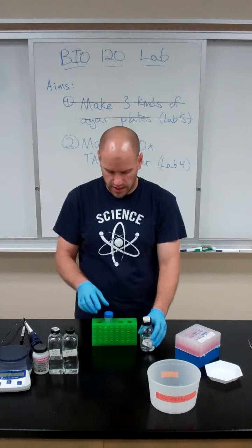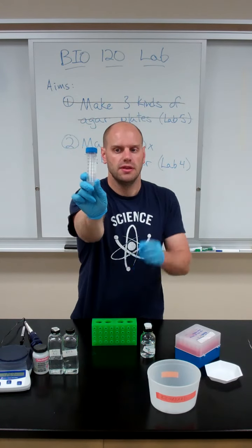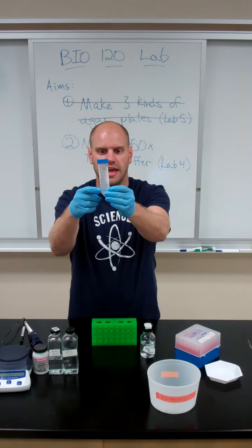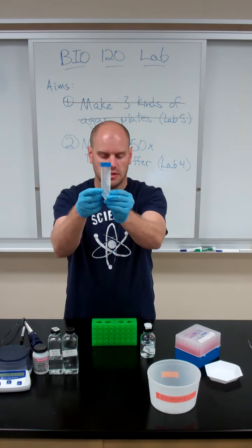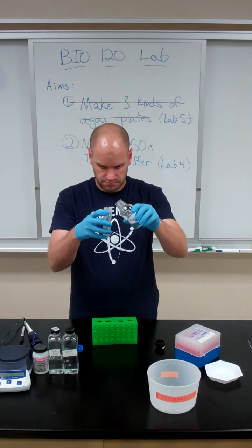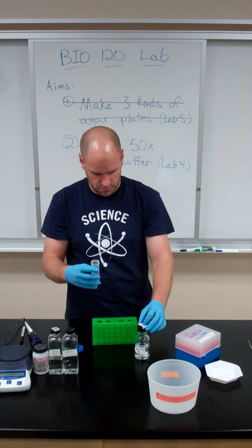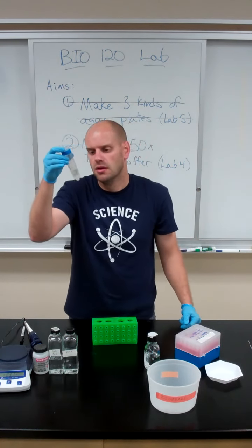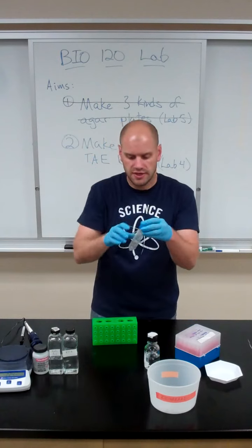Lastly, we're going to add our water up to the 10 mL mark. You'll notice on the side of your 50 mL conical tube that there are graduations — you can just add sterile water to 10 mLs, which should be about where my right finger is. We can do that by just pouring some in. Then swirl your tube a bit and wait for your Tris powder to dissolve, and you'll have 50X TAE.